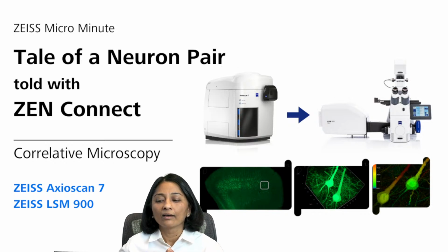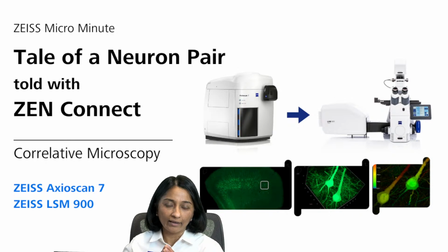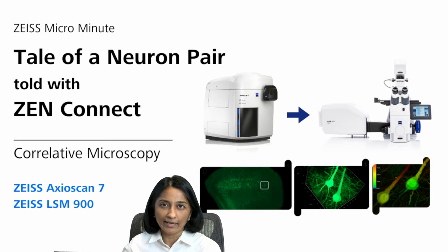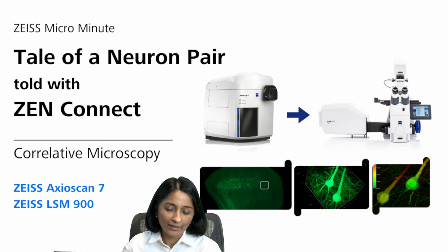What I want to show you today is that I go from the Axioscan, imaging a brain section, all the way to the LSM 900, imaging the very same brain section. And I don't look through the eyepieces ever, even once, and that's a promise that I will keep.